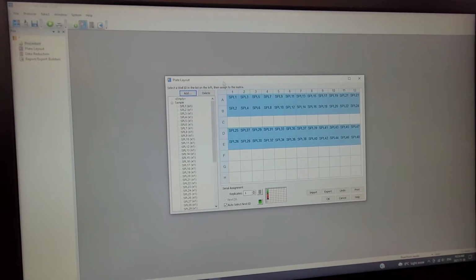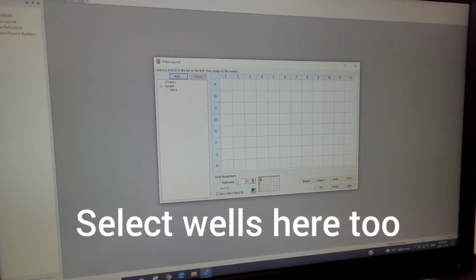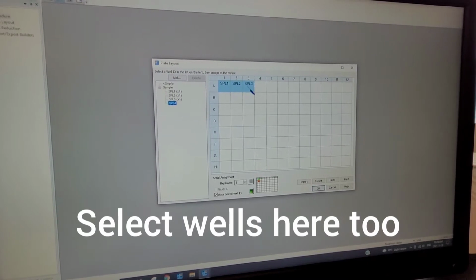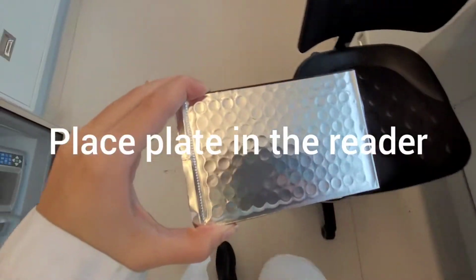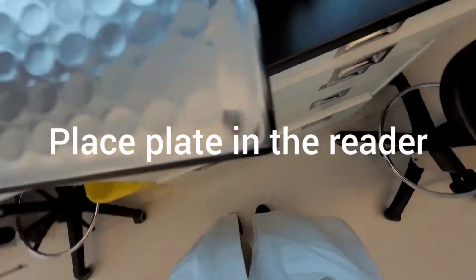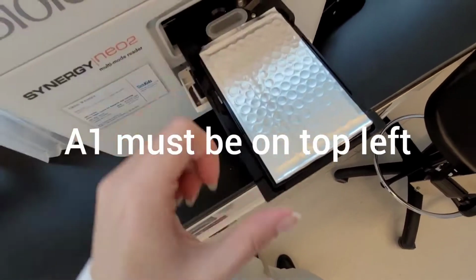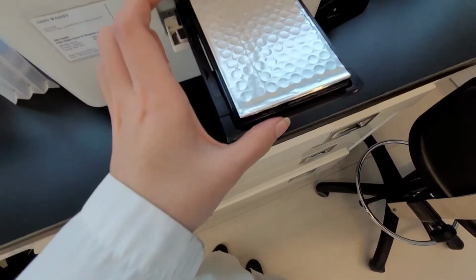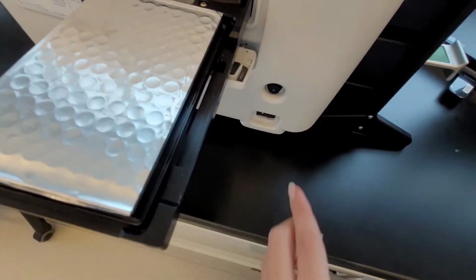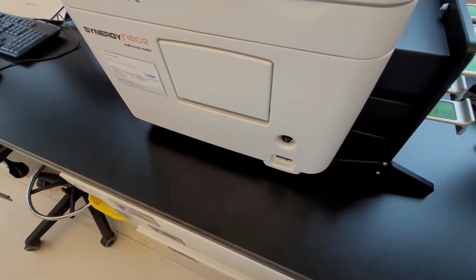So I select the total time, and I usually do 1 read per hour, and I add a shake step before every read. Also, you want to select the wells again, because there is one selection that shows which one to read and one that shows which one to show the data for. So there were 2 places where we had to select the wells.